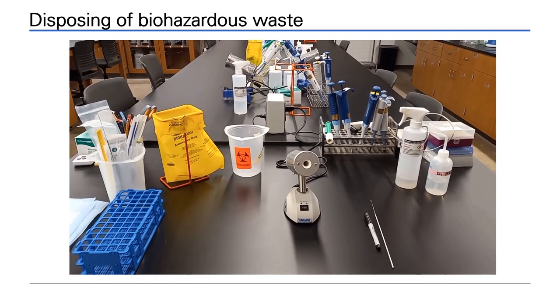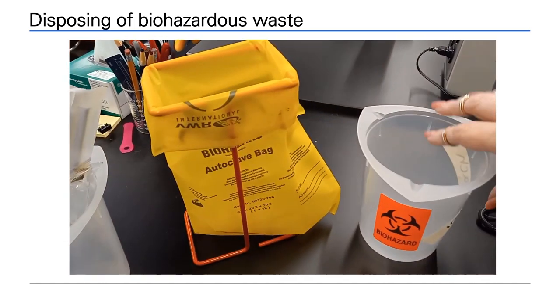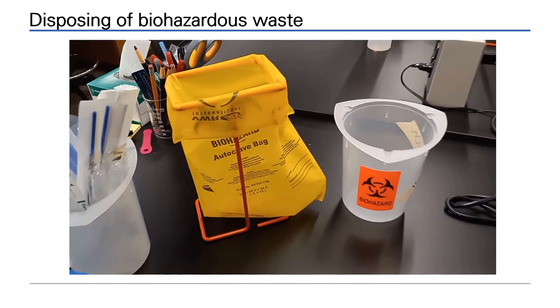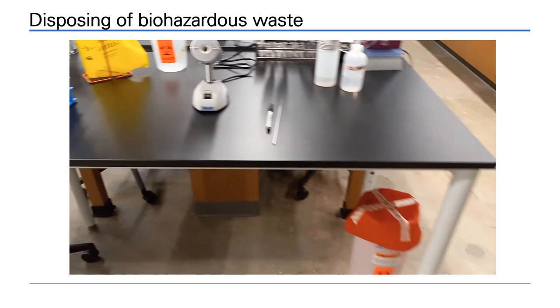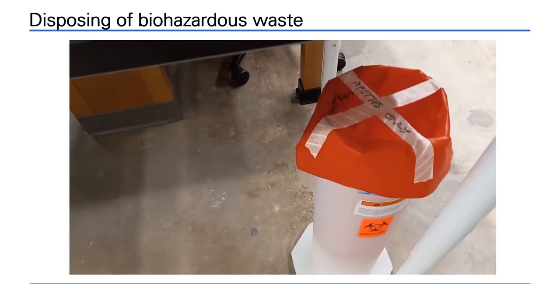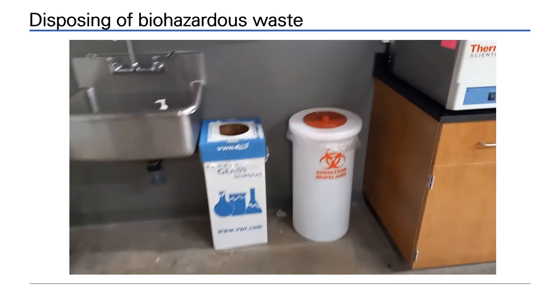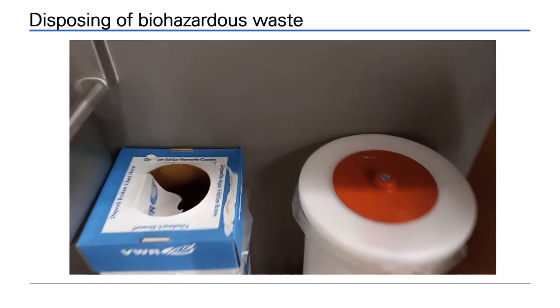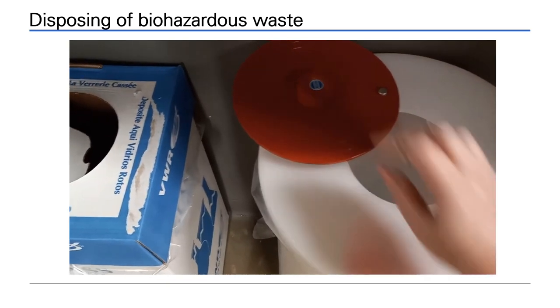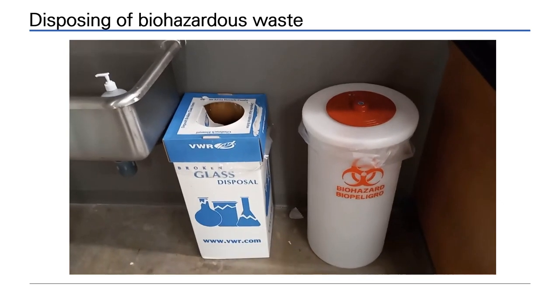Biohazard waste generated at the workstation can be liquid or solid. Liquid goes in the 10% bleach solution in a pot. Solid goes in the autoclave bag. Any sharp plastic serological pipettes go into pipette canisters. Large amounts of waste are collected in biohazard bins — the lids swivel off and must be closed after dropping waste inside. Any glass biohazard goes in the glass bin.